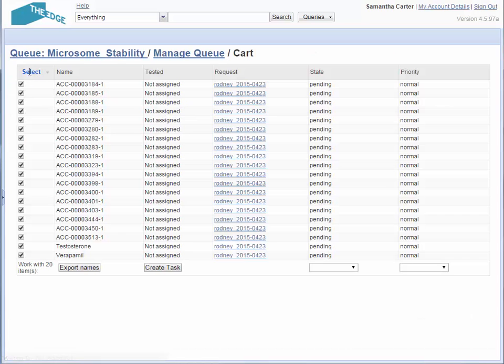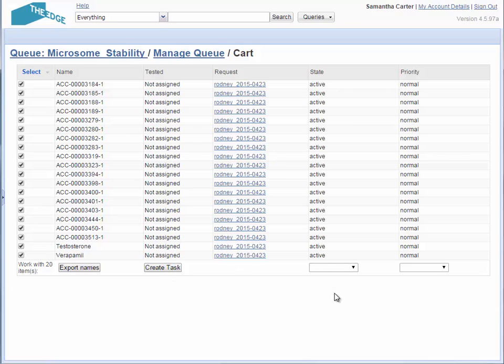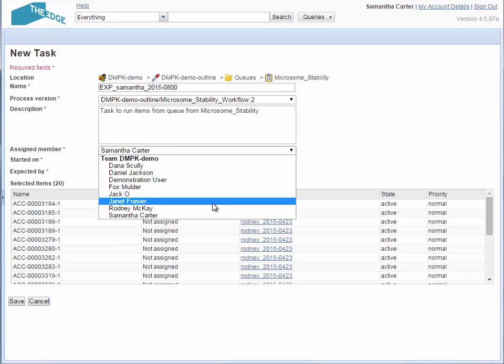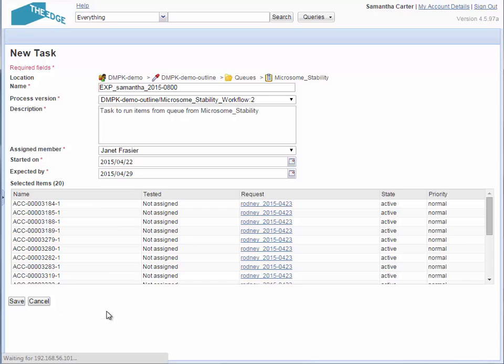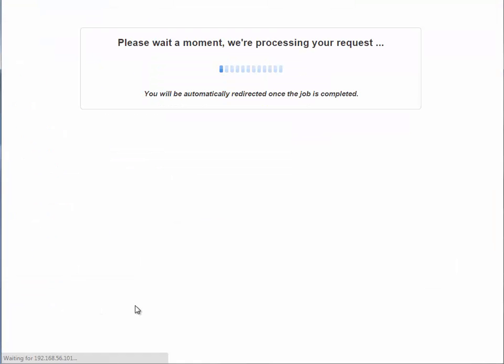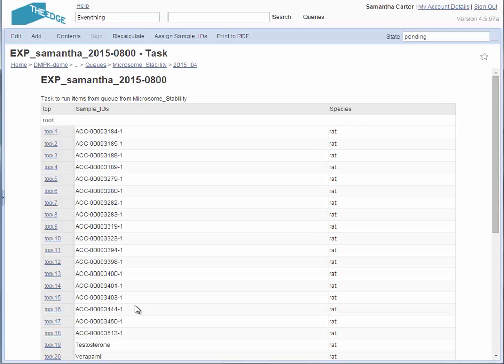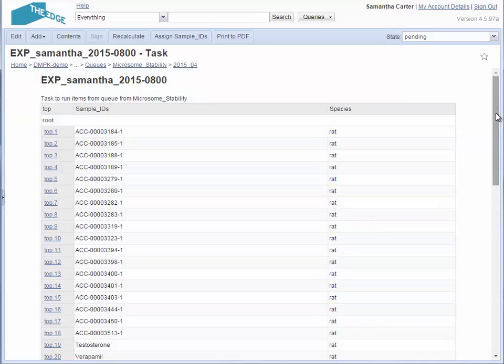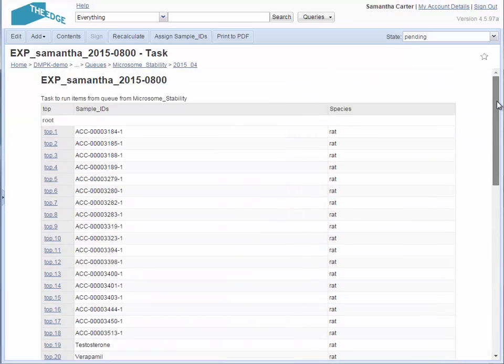Selecting the new items allows me to put them into a work task. I set the items to active so that Rodney knows that they are being worked on. I then create a new task which I will assign to the DMPK scientist Janet Frazier. The completed task contains all of the details and settings required to carry out the assay.